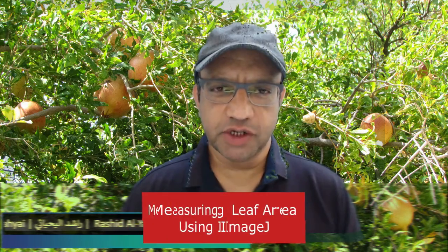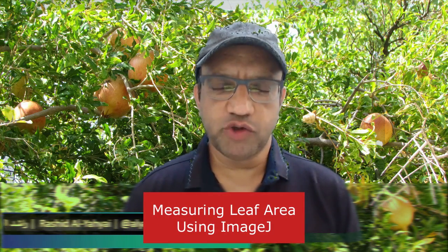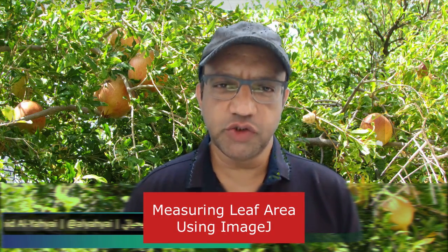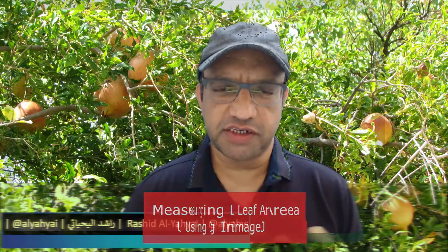Greetings and welcome back. Today I'm going to show you how to measure leaf area using ImageJ. It's very simple software that I have already made a tutorial on how to download and install on your computer. Now we are going to use it to measure leaf area.